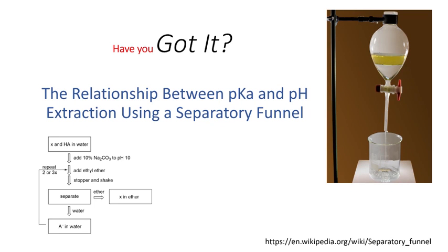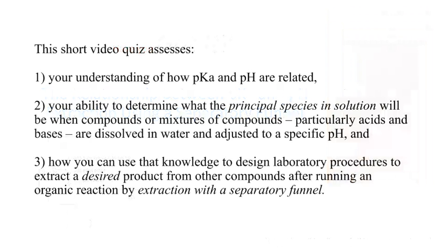The relationship between pKa and pH, extraction using a separatory funnel. Have you got it? This video quiz assesses your understanding of how pKa and pH are related, your ability to determine what the principal species in solution will be when compounds or mixtures of compounds, particularly acids and bases, are dissolved in water and adjusted to a specific pH, and how you can use that knowledge to design laboratory procedures to extract a desired product from other compounds after running an organic reaction by extraction with a separatory funnel.